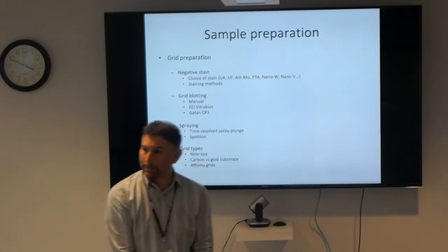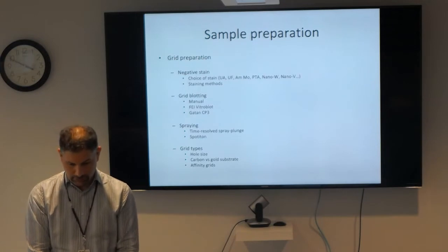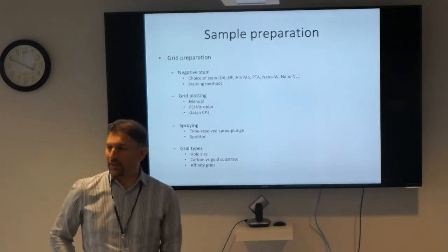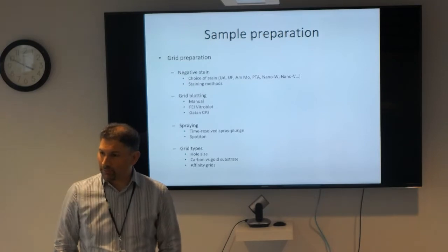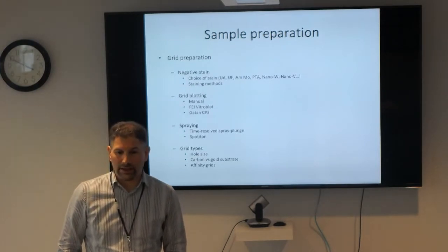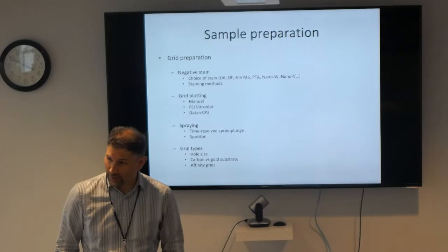Question. Yes. When you get started, what is your usual go-to? Like when you're going from negative stain EM to cryo, what is your starting point? Is it just a C-flat? I go with the C-flat. Okay. You don't just go straight to gold or anything? No, because C-flats are cheaper, and if you can get good power spectra coming off of a C-flat, great. It also depends on how much sample you have. For example, if we don't have that much sample or the concentration isn't that high, then we'll go to a gold.